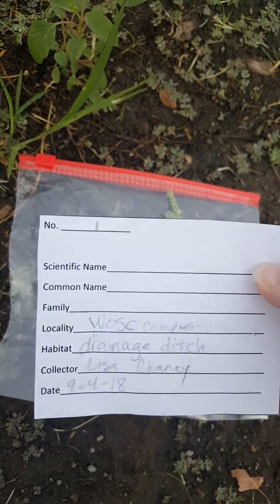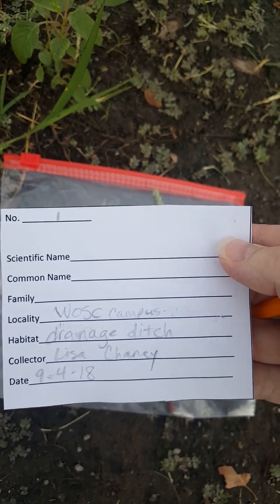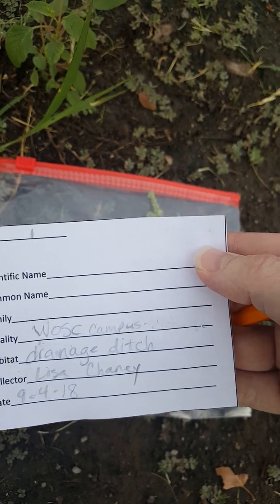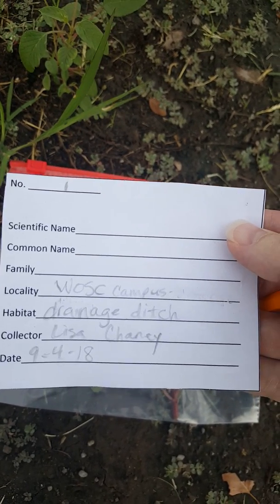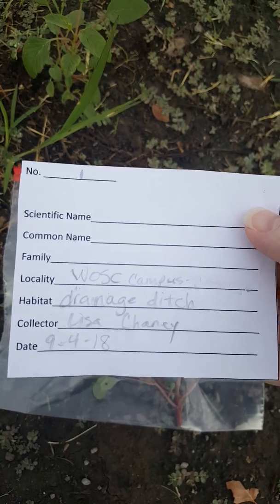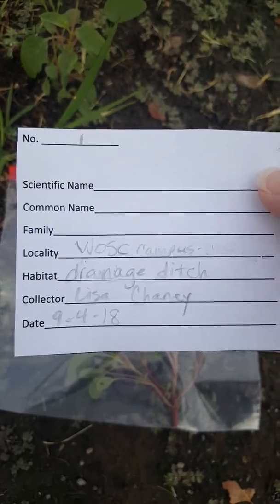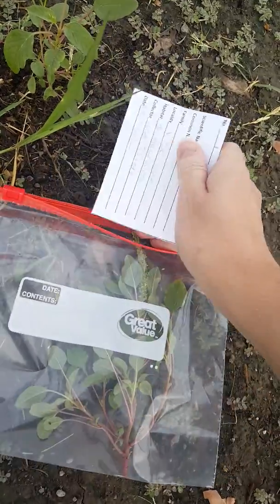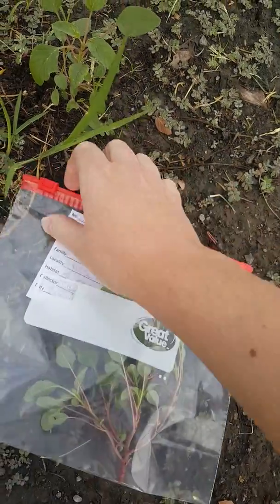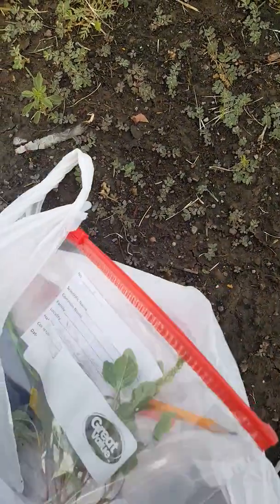And so I'm going to put a number 1 because it's the first plant that I've collected, and we're going to say that I don't know the scientific name, the common name, or the family yet, because that's going to be fairly common for you, and so you can leave those blank for now until you can identify them later. The locality, I'm just going to put WOSC campus, and the habitat, I'm going to say it's a drainage ditch. And then you put your name as the collector and the date that you collected it, and then you'll put this inside of the bag. And then I just have a plastic sack that I'm keeping all my collected plants in for today.